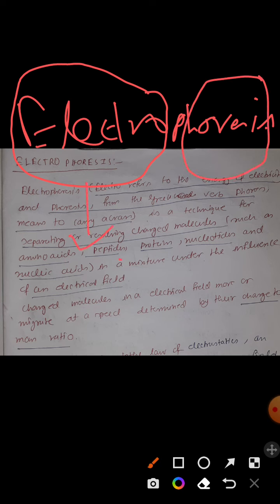Electro means energy of electricity, and phoresis comes from the Greek word phoros, which means to carry across. So what does electrophoresis mean? Electrophoresis means that here we are using the electric charge as an energy to carry some molecules, right?